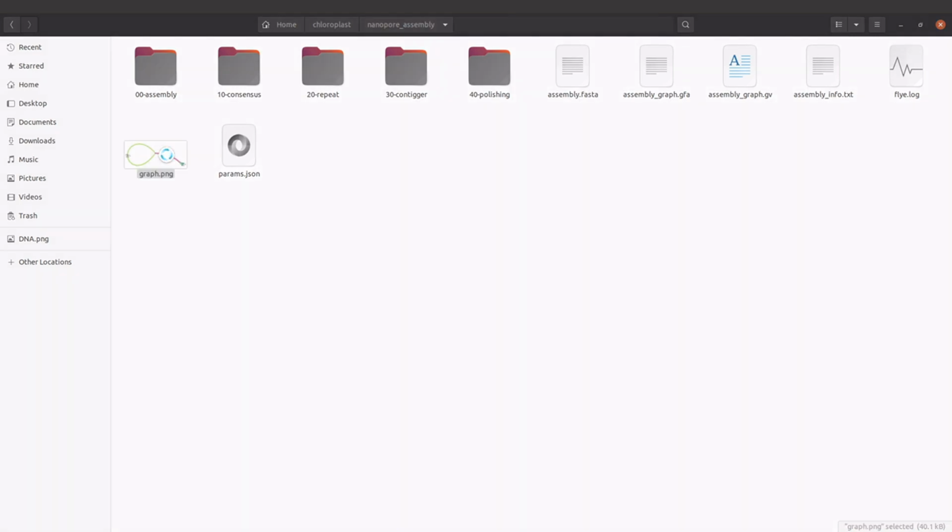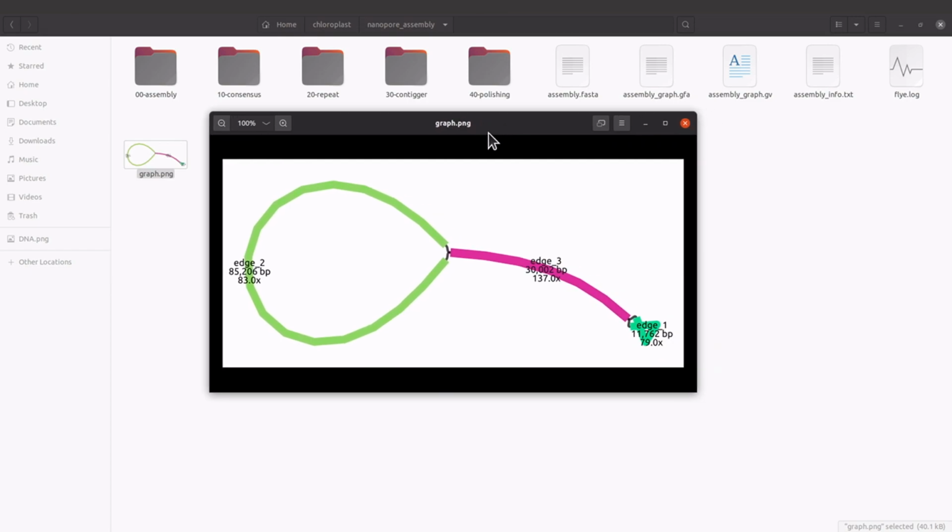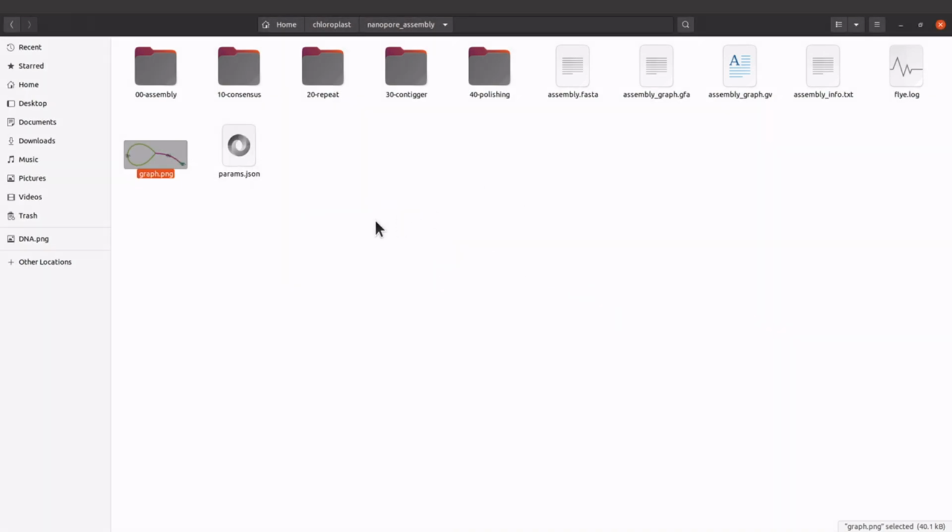This is it. You can open it, and if, let's say, you are going to send a report, you can just insert this image in your report. You can have your Word document or spreadsheet or whatever, and then you just add this image to it. The labels too, you can decide to enable or disable them. That is up to you. So that's what we have. This is how we visualize a genome assembly using Bandage.